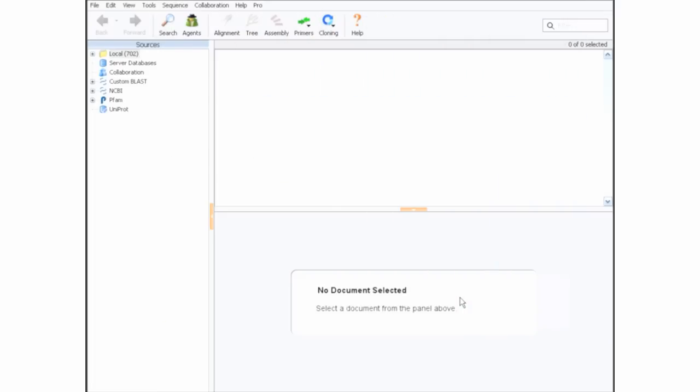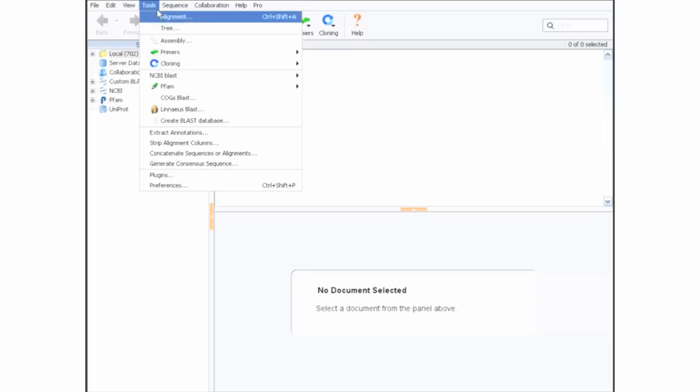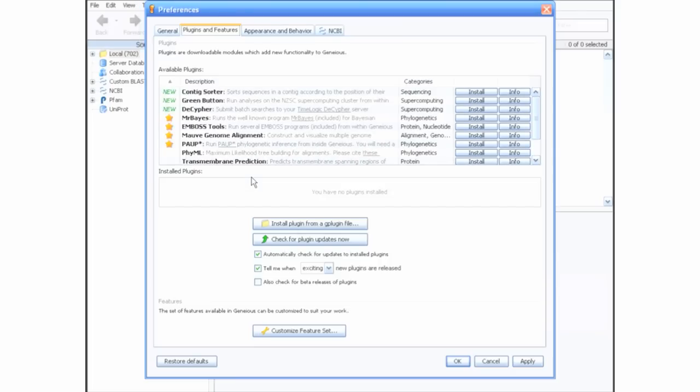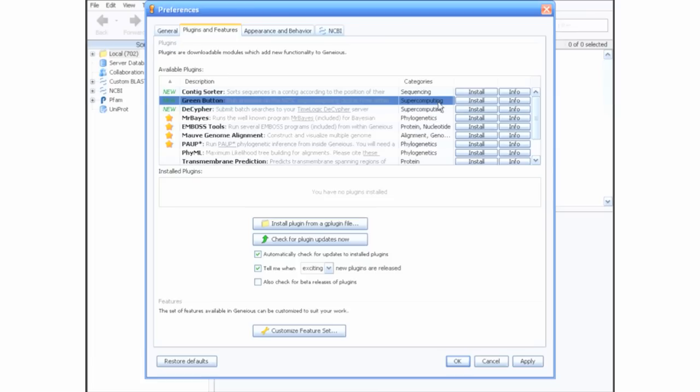Once you have created your account, you are ready to install the plugin. To do this, open Genius and select Plugins from the Tools menu. This is where you can easily add and remove extra functionality to Genius, including Green Button and Supercomputing enabled plugins such as Mr. Bayes.